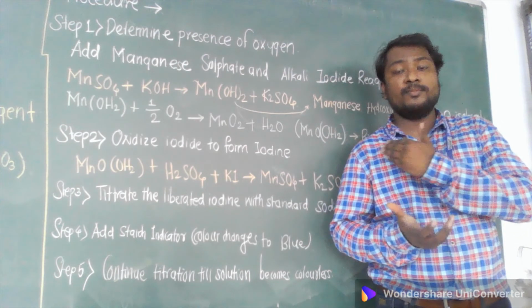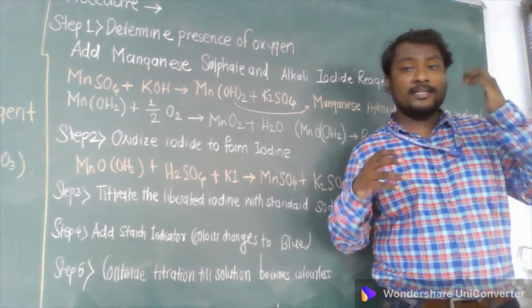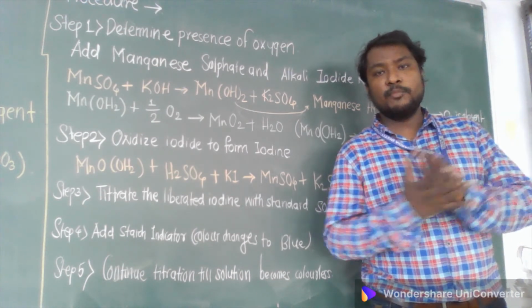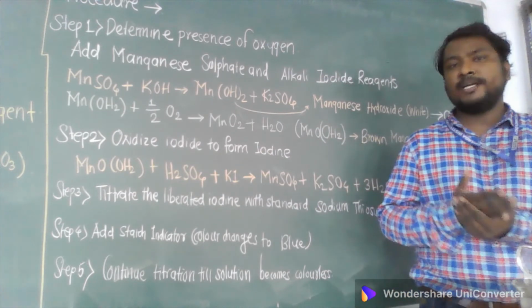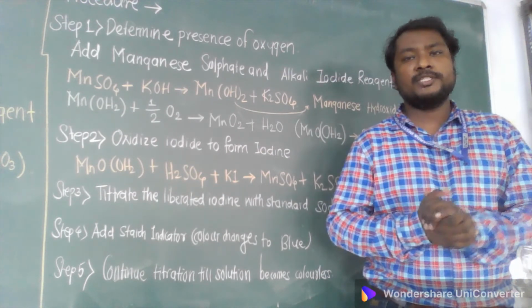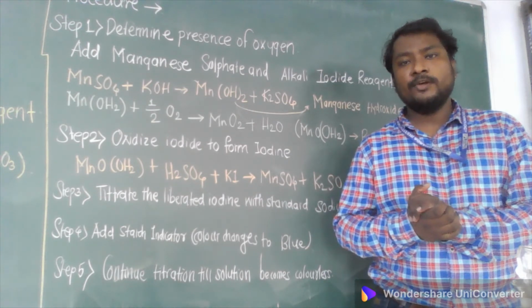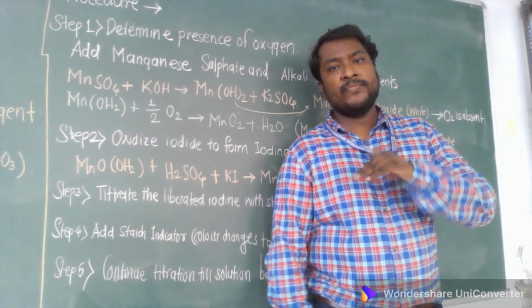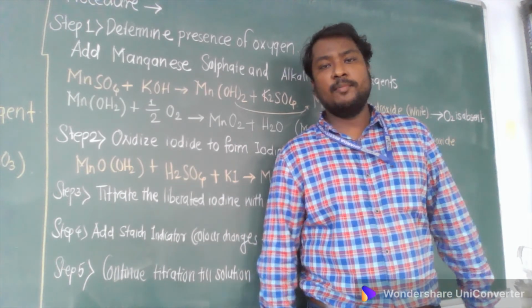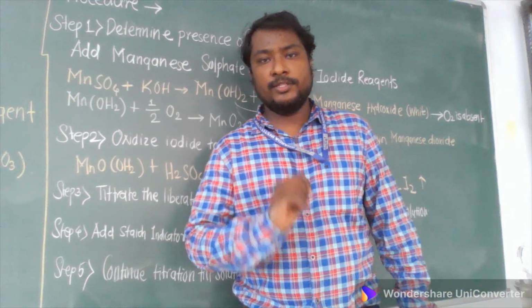That is the procedure of this experiment, a very interesting experiment, and we have seen the reagents required. Why do I say this is interesting? After doing the demonstration of this experiment, you will know why this experiment is important and why its procedure is quite interesting. We will see the actual demonstration in this video. Thank you for listening to the procedure, and we have just studied the reagents. Let's move towards the demonstration. We will see the demonstration of this experiment, dissolved oxygen.